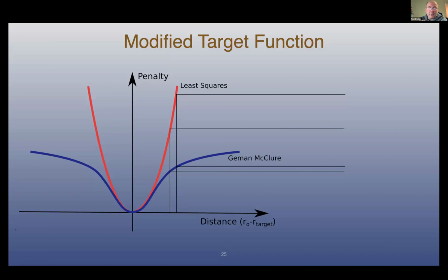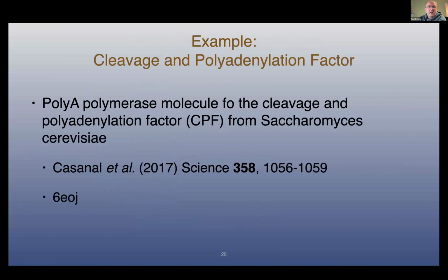It's not zero, but it's increasingly less. And what that allows us to do is to keep the local distances consistent. Lots of local distances restrained, but allow a few to be kind of broken, because after some time they just give up contributing to the target function. So I think that says large contribution and small contribution. I can't see because it's obscured.